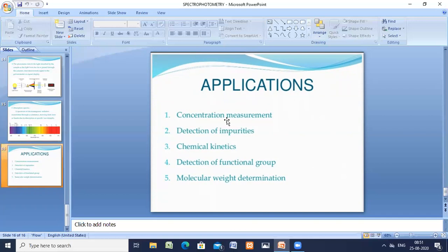Small amounts of chromium can be detected colorimetrically in an alkaline solution of the chromate. Absorbance is measured at 365 to 370 nanometers. Potassium chromate is used as the standard solution. Chromium is generally oxidized to chromate by perchlorate. The color is intensified by ferric perchlorate, which is colorless.